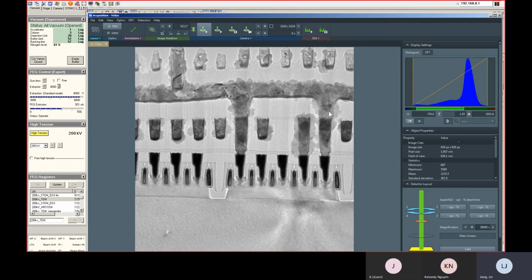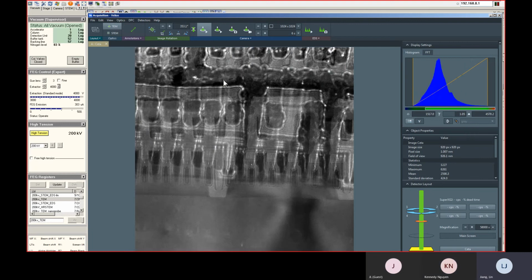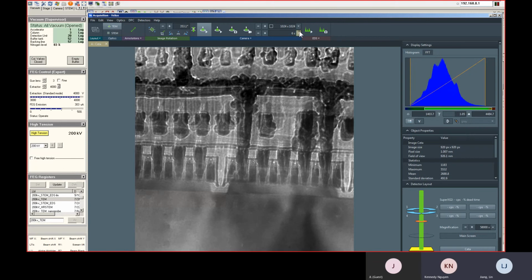Okay, it's your turn now. That should be enough, I guess. I guess we just have to focus the image. Let me know when you feel focus is good. When you do focusing, because your exposure time is 6 seconds, it's so slow, right? Yeah.